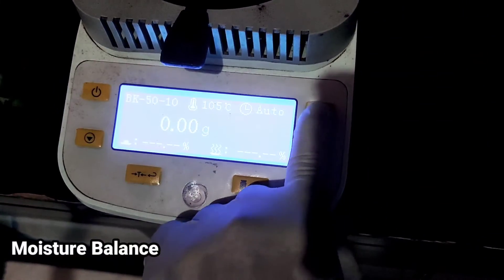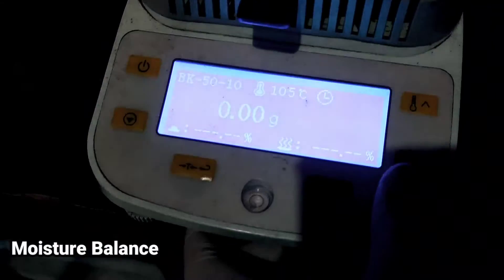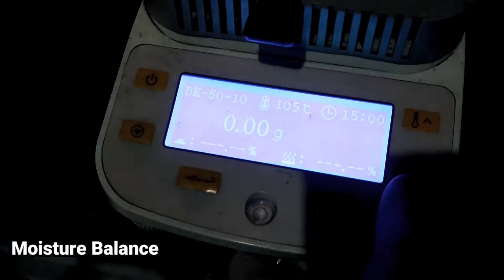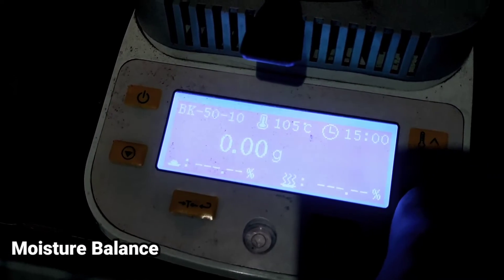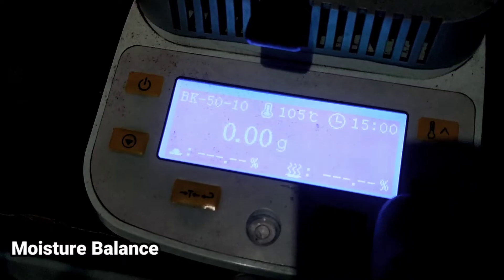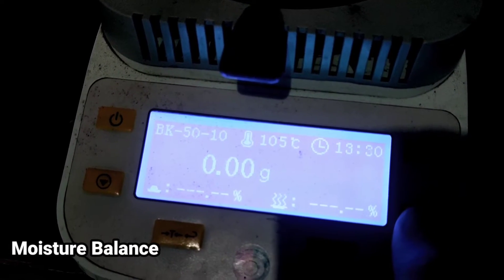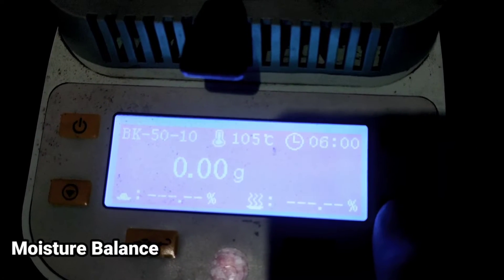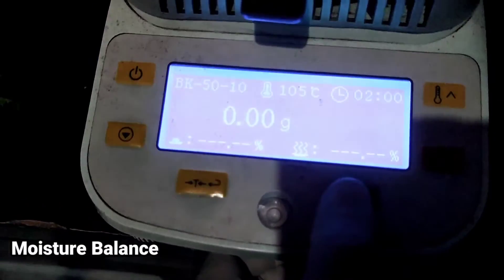Untuk waktunya, kita bisa atur. Untuk mengubah waktu, kita tekan — misalkan kita mau waktu, tekan sini, baru kita kurangin. Saya mau mencoba 2 menit.